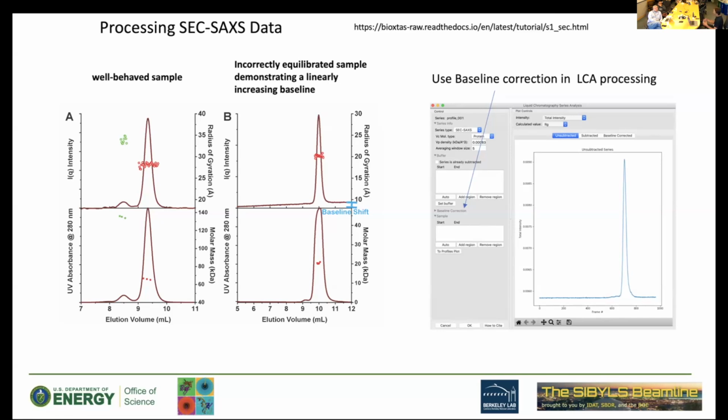In your package, what you get is the data that are analyzed in RAW. And in RAW, you can go back and upload your HDF5 file. You have all the information in a README file, so you don't need to make notes now. There is a possibility of processing your data. We normally do this for you. You get your final curve, and you get the processed and corrected baseline. But here is the baseline correction button that you can use if you want to reanalyze something.